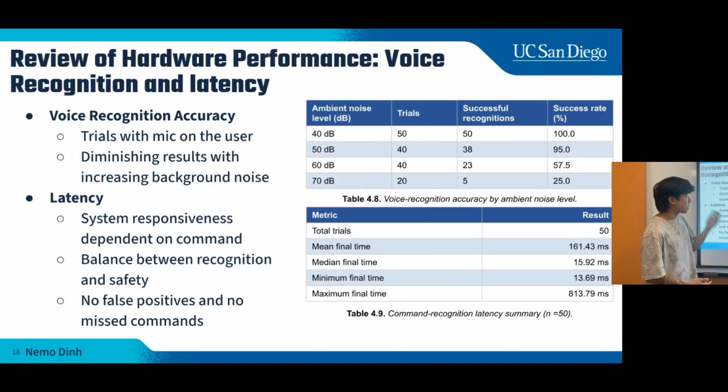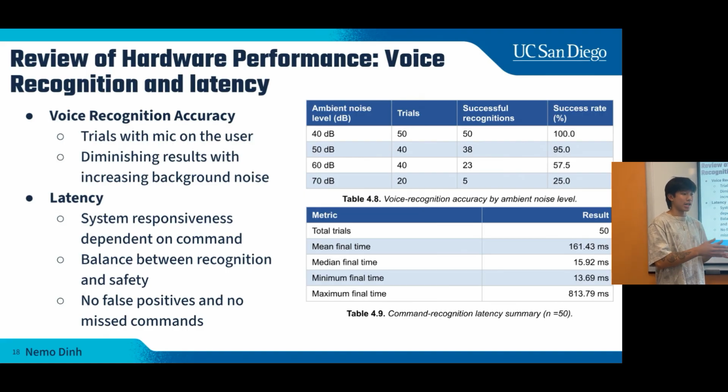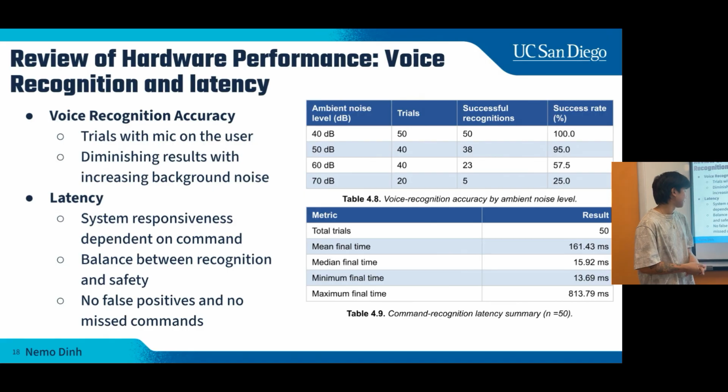For the latency, our goal was less than 1 second response time, and we cleared that very well. We were around 0.8 seconds at maximum for the response times. It is important to note that the response times differ between the different commands because of a system we have in place that preemptively starts the motion if it hears a partial command. For instance, if it hears inject, it will start the motion, but if it hears the rest of the command, like inject 2, it will then finish that command and go that specified distance.